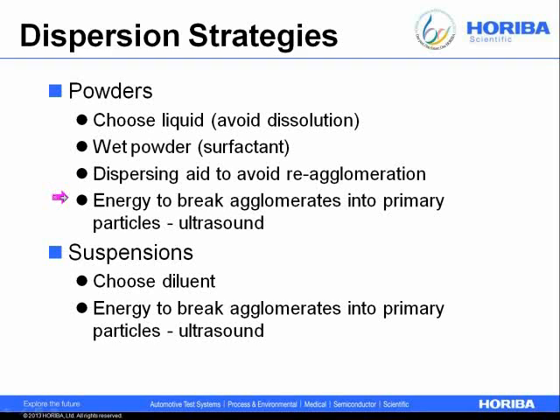And you might need to feed in enough energy to break up these agglomerates into primary particles. Now, often this is ultrasound for nanoparticles. Now the mercy in this is that unlike formulations, say for pharmaceutical work, we don't need to have a really, really stable suspension. We just need it to be stable long enough to make our measurements.